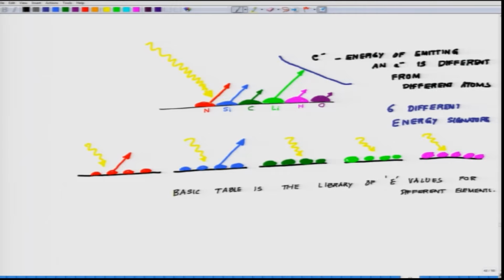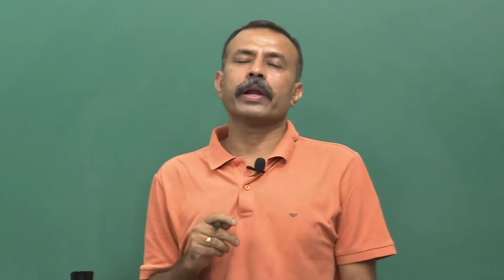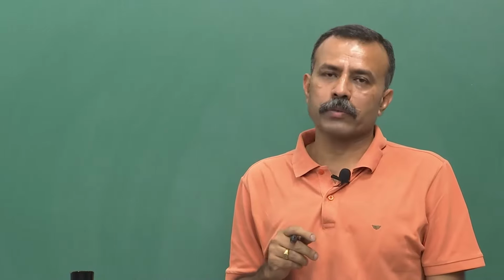If you know those values, then you can back calculate from this mixed substrate and figure out what elements are present on that particular substrate. So this is how you analyze a substrate, to find which different elements are present on it.